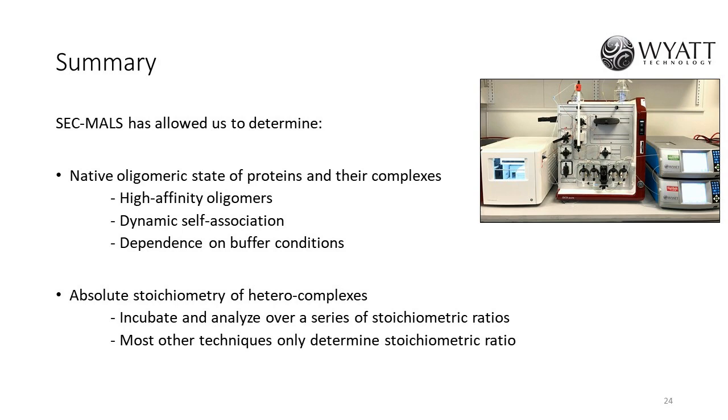Okay, thank you. All right, this next question has a few parts to it. Are you concerned that column matrix interactions could confound your results? How can you confirm that these complexes exist in solution? And have you considered composition gradient MALS? So we confirmed our interactions with analytical ultracentrifugation, at both the salts and with the relevant titrations.